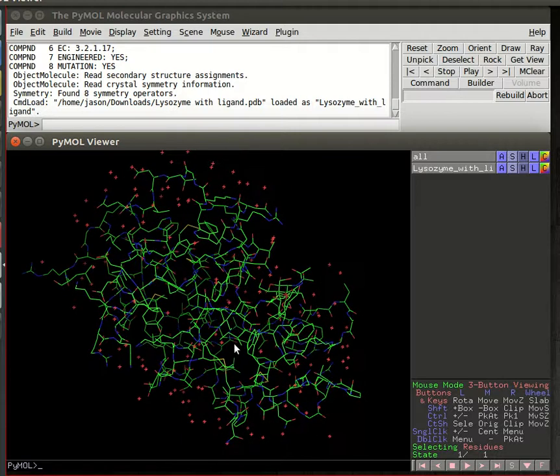My intention today is to show you some of the stuff you can do with PyMOL, with the PDB files that I've asked you guys to download and look at. I've asked you to make a couple of figures. I'm not going to go through every single thing that I've put together in the protocol or everything that I've asked you to do to generate these figures. But we will walk through some ideas that may make things a little bit easier for you.